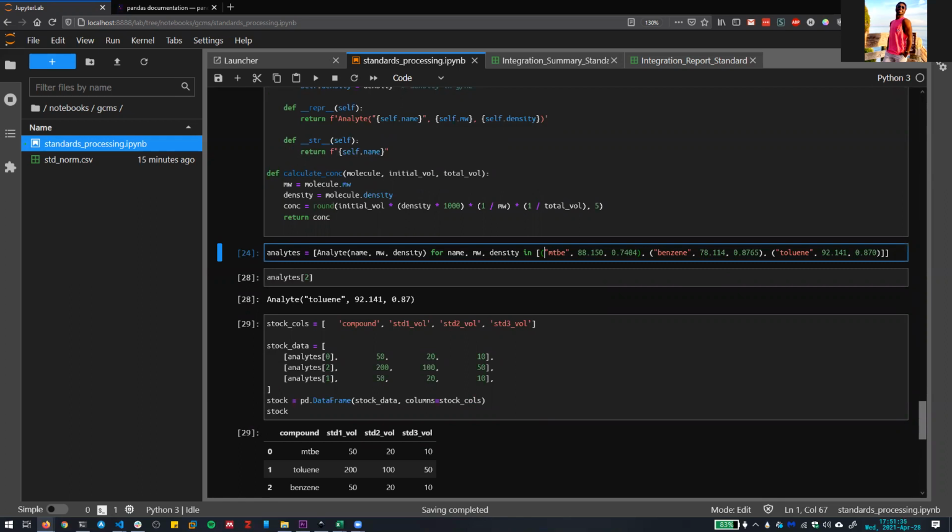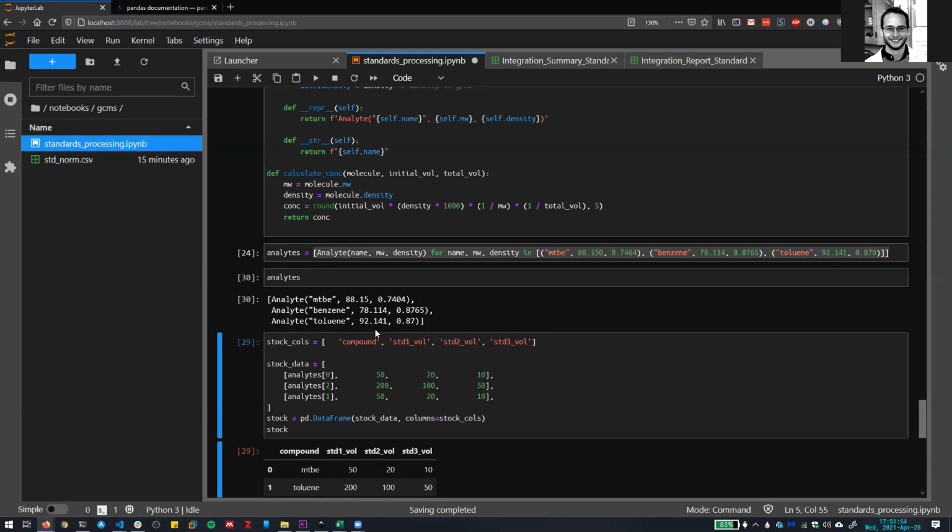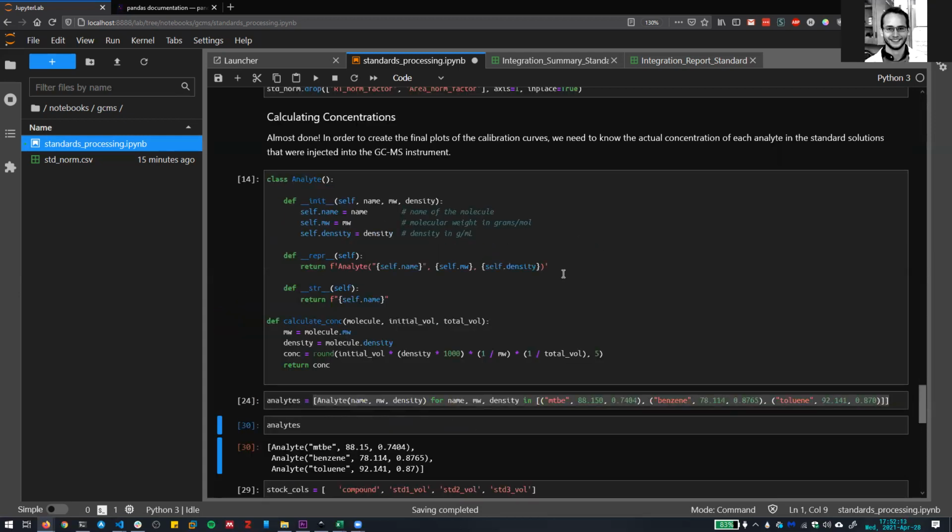I haven't received any errors, but I don't see anything happening. Oh yeah, well the cell as it is doesn't output anything. It just sets this variable analytes to this whole thing here. If you make a new cell by clicking the plus sign, and then you just type analytes, it'll output this stuff. Does that work for you? Okay. And yes, but I have another question. How is this one-line code different from the one you did right on top, above? Right on top. Yeah, that one.